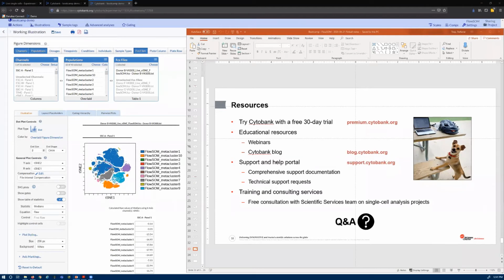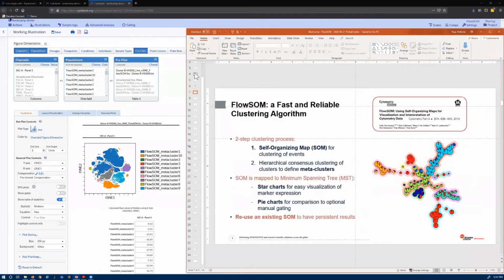That's perfect. Okay, a very technical question that maybe someone skipped: what does the cluster number refer to? So I'm going to get Steph to answer this. So sorry. The cluster number is the number of groups of events that you have selected for your data to be divided into. So let me go back to show you the grid.